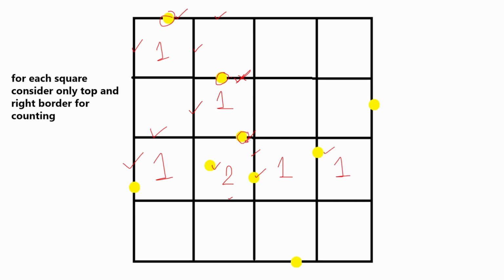So you can see if I had counted this cell over here into this box, it would have given me number 3. Whereas when I had moved on to the next one, I would have gotten confused if I had taken this cell into consideration when I was counting in this box, or should I write it over here. So this is why when you're counting in a hemocytometer, you only take 2 of the boundaries into consideration, the cells touching them, whereas the bottom and the left one belong to the next cell.